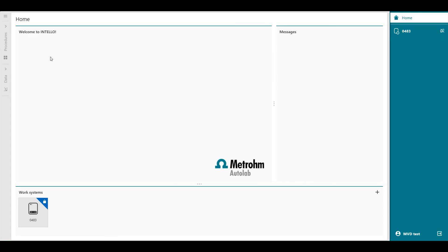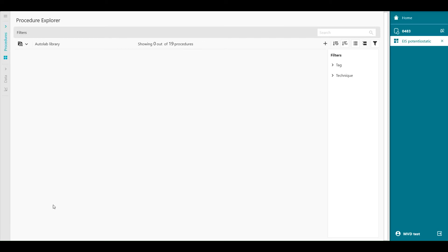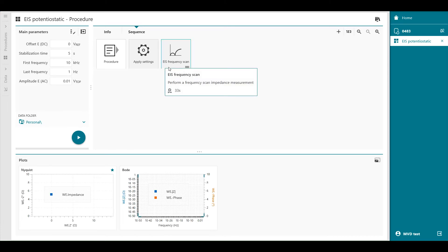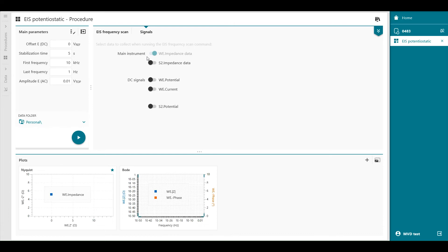Welcome to Intelo software. In the procedures, you will find EIS potentiostatic as a default procedure. In the default procedure, we measure the impedance on the working electrode. To enable the impedance measurement on the second sense, we have to enable the S2 signals. So we go to the sequence, where we will find EIS frequency scan. When we double click on it, you will find the signals tab, and in the main instrument you will find the S2 impedance data. So now we're also recording the impedance on the S2 electrode.